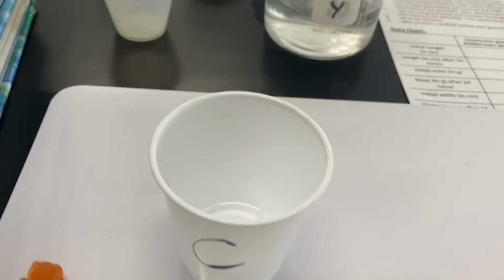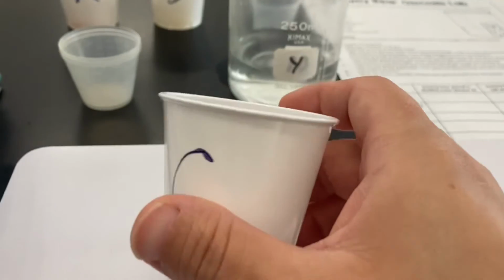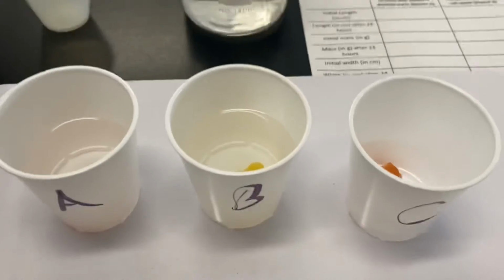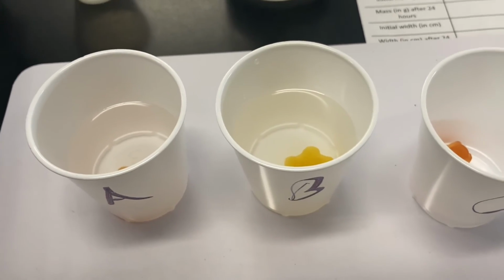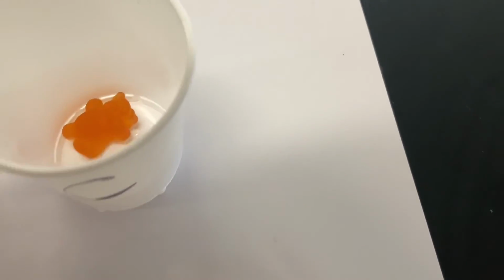Okay, now for C, we're just going to put that gummy bear into the beaker. So there's going to be no water, no salt water, just a gummy bear in a cup, in a beaker. Now I have my 3 little beakers here: regular tap water, salt water, and nothing.